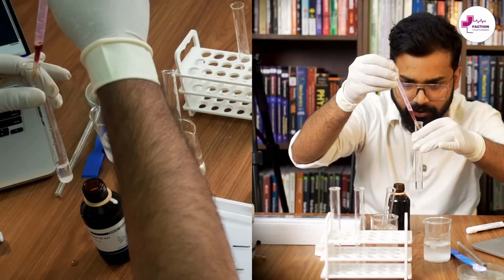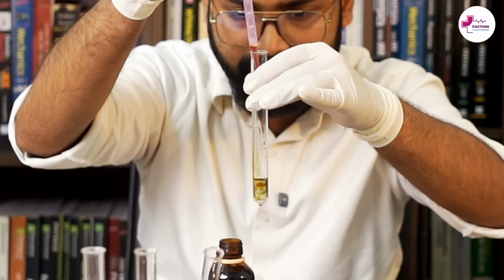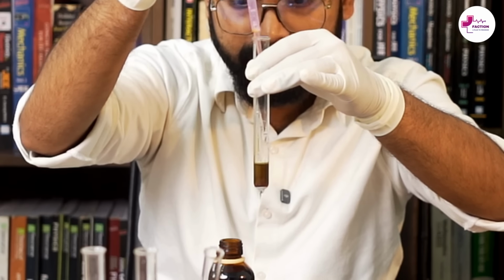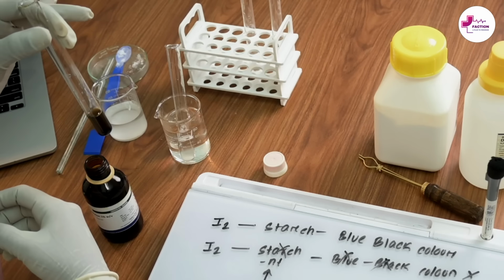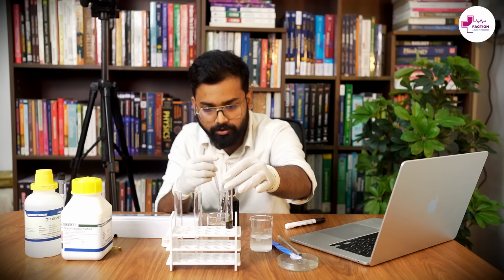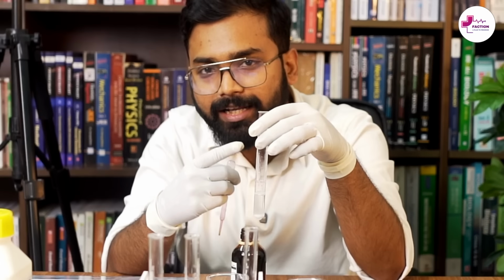Let me add a few drops of iodine right here. So I have added a few drops of iodine right here where the amylase was absent. Now I will put a drop of iodine to the other test tube that had amylase present.